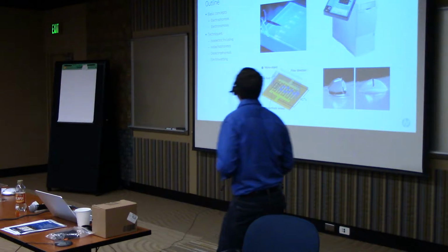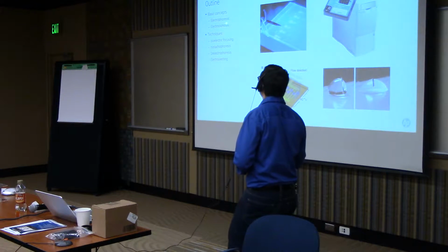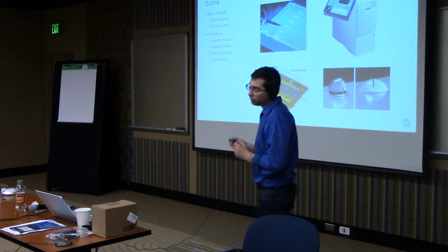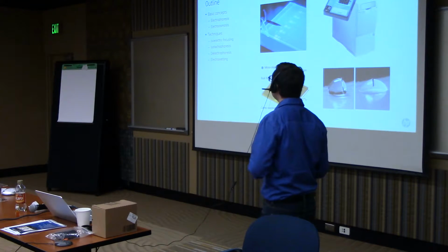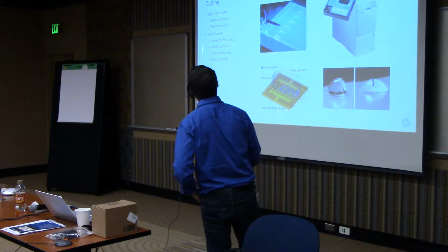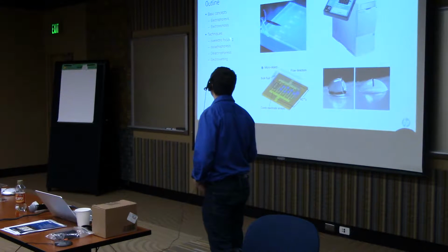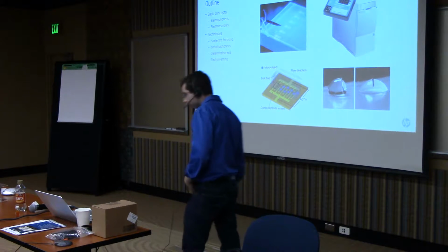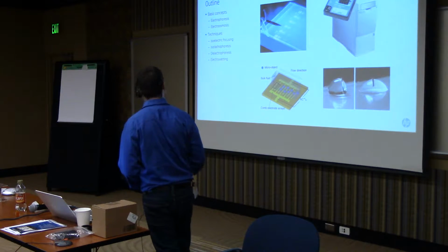So we'll talk about the most basic things in electrically actuated microfluidics, and that is electrophoresis and electroosmosis. Those are actually very related phenomena, sort of an inverse of the other. Then I'll talk about the four most common and most basic techniques of electrically actuated microfluidics: isoelectric focusing, isotachophoresis, dielectrophoresis, and electrowetting. And here you see examples of various little devices that use this.